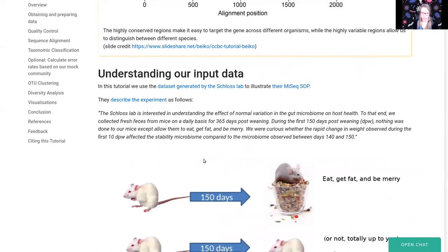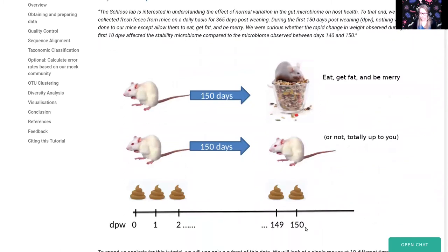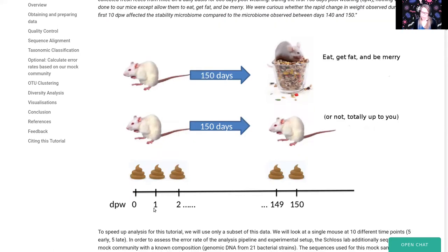The data we will use was also generated by the Schlosslab, the creators of the Mothur toolset. They had a very large experiment where they followed a large set of mice for one year, sampling their feces every day and sequencing it. For the first 150 days they let the mice grow naturally to assess natural variation in microbiomes between mice. This is 150 time points — too much for this tutorial — so we take just the first 10 and the last 10 of the 150-day period for one mouse and compare those two.